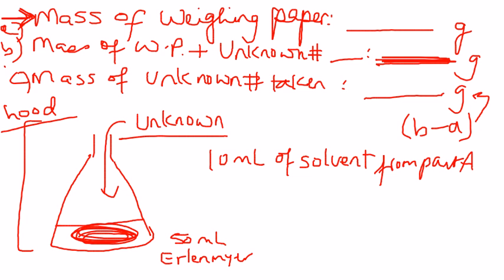Now, realize that as you're heating, it's a possibility that some of your compound will tend to crash out, because you're quickly removing some of the solvent. As it's heating up, it's getting evaporated as well.